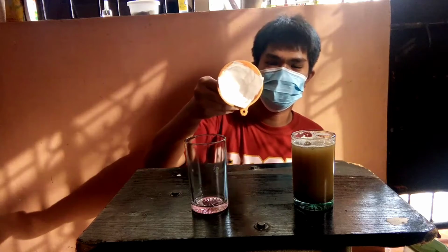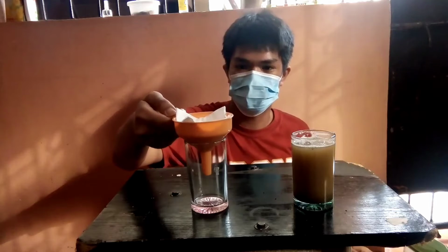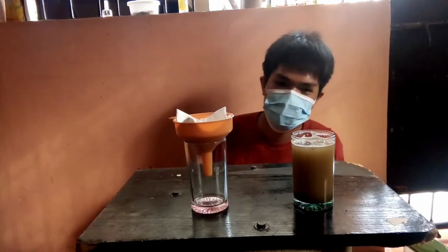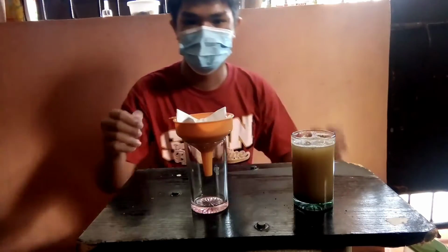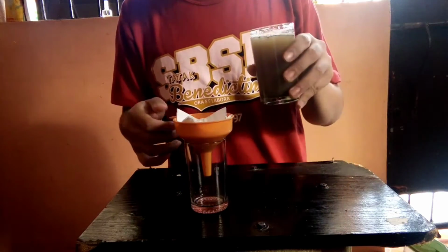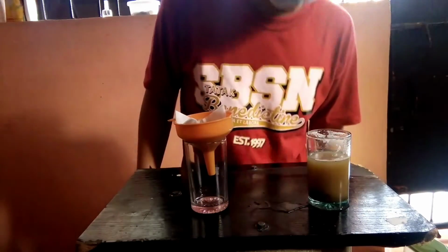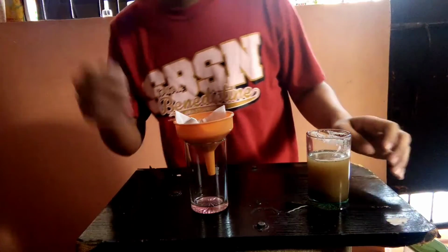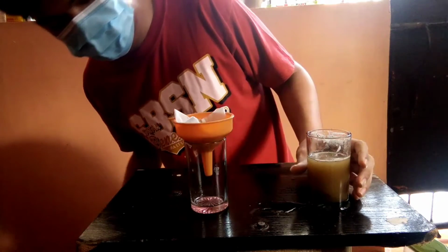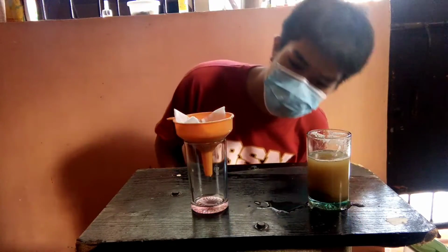So now we have the filter. Now we're just going to put it on this other glass bottle. Now the last and final procedure is we're going to pour the dirt and water mixture for filtration. You see, the drip is very slow, but as you can see, it filters out the dirt and water.